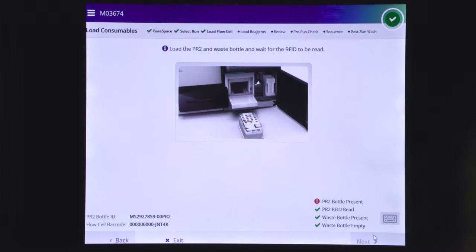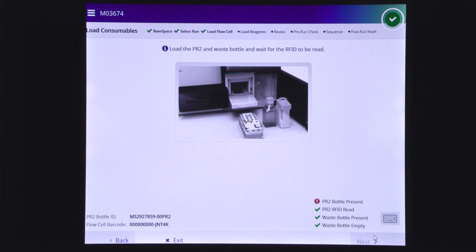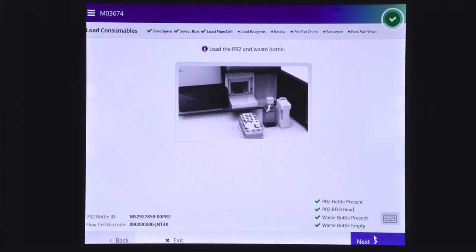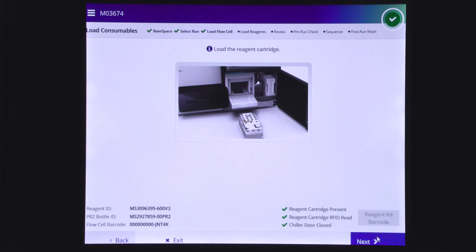The control software will identify the RFID of the PR2 bottle. If the software does not identify the RFID of the PR2 bottle, check the Resolve RFID Read Failure section in the MySeq system guide. After RFID identification is completed, select next.